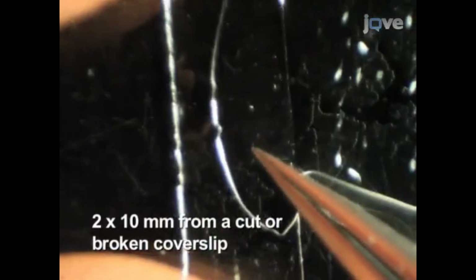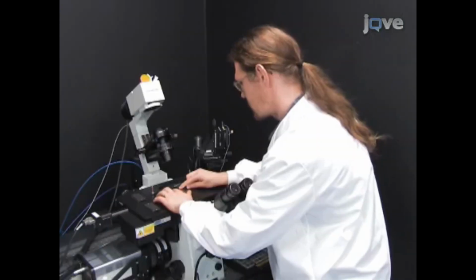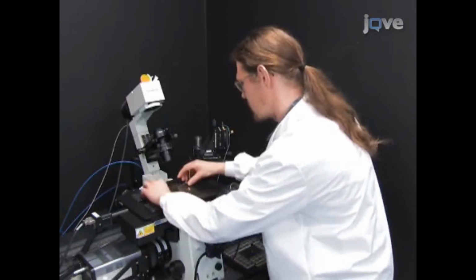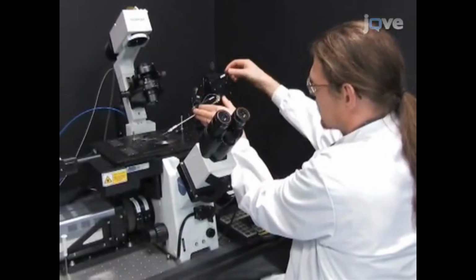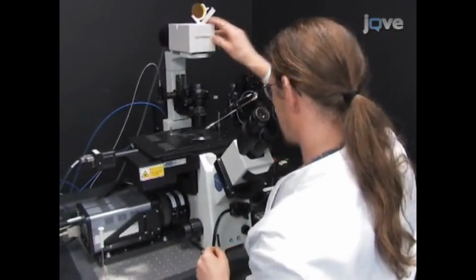Now place a small piece of glass adjacent to the samples and mount the slide on the microscope stage. The glass will serve as a wall to break or unclog the needle. Prepare the microscope and injection apparatus for the experiment, taking care not to break the needle tip.